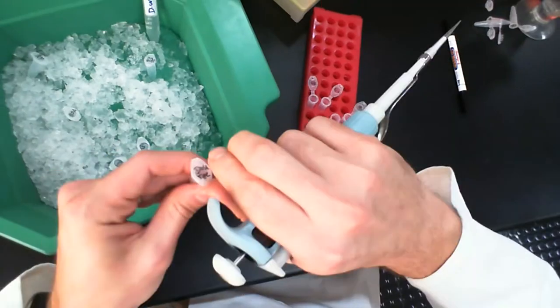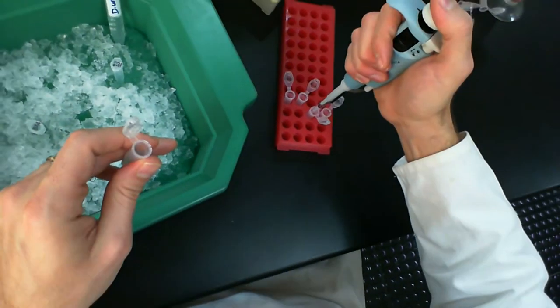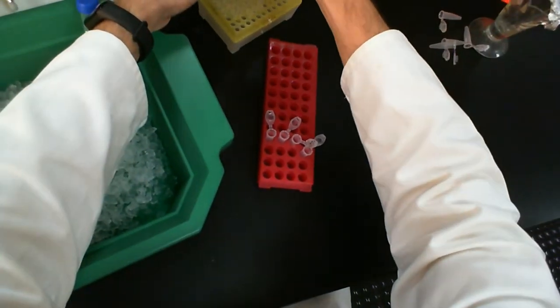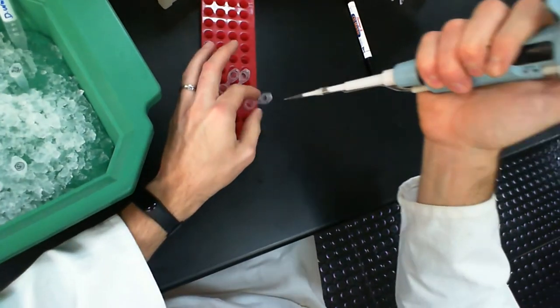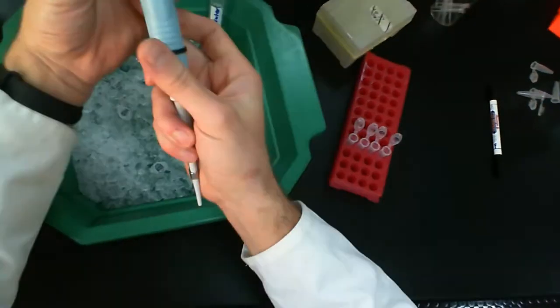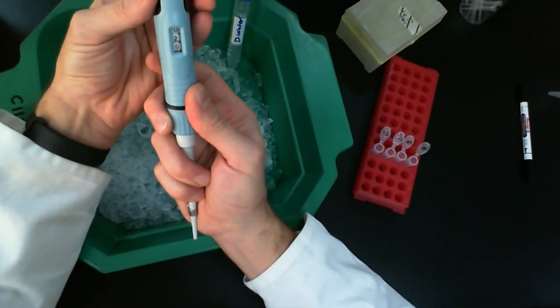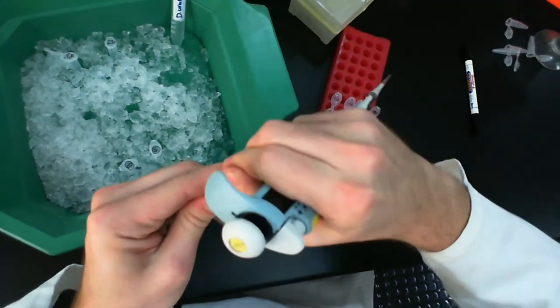Okay, so I'm going to take my DNA sample 2. I'm going to add 4 microliters of this one to tube 1, and 4 microliters of this DNA to tube number 2. Okay, so I've got DNA in all of them. I have my buffer in all of them. I'm going to add BSA, and then in this case again I need to go back to 2 microliters, so I'm going to change this back to 2. Okay. And so BSA goes into all of them.